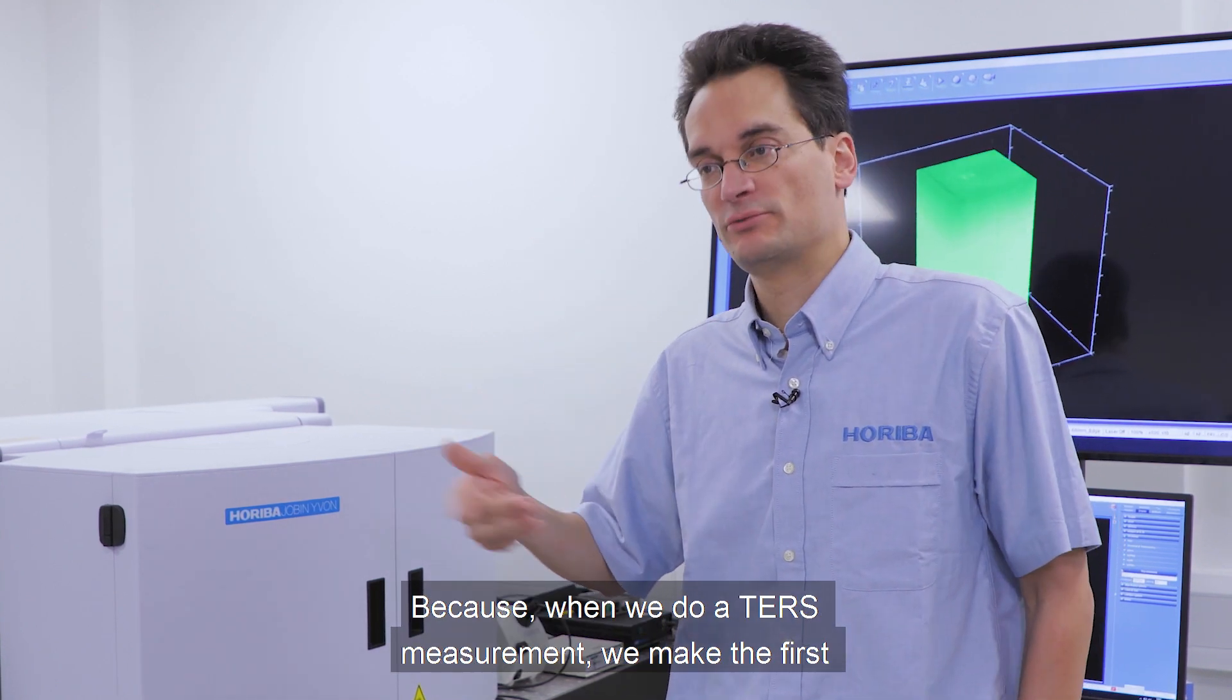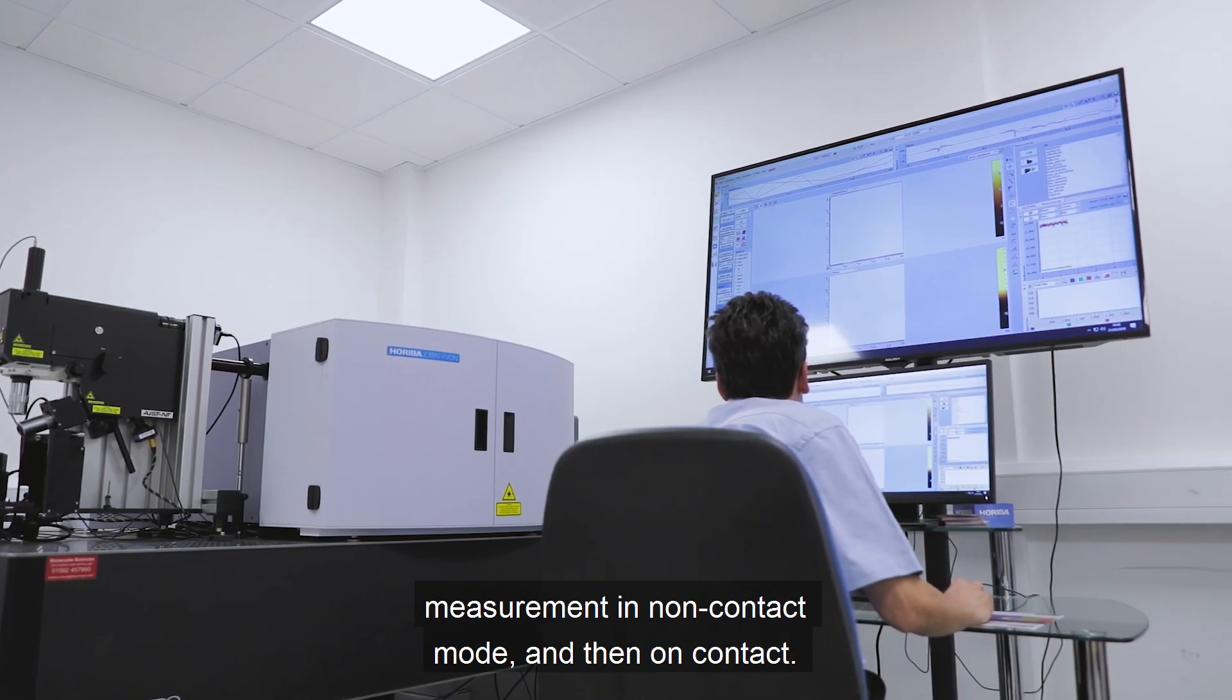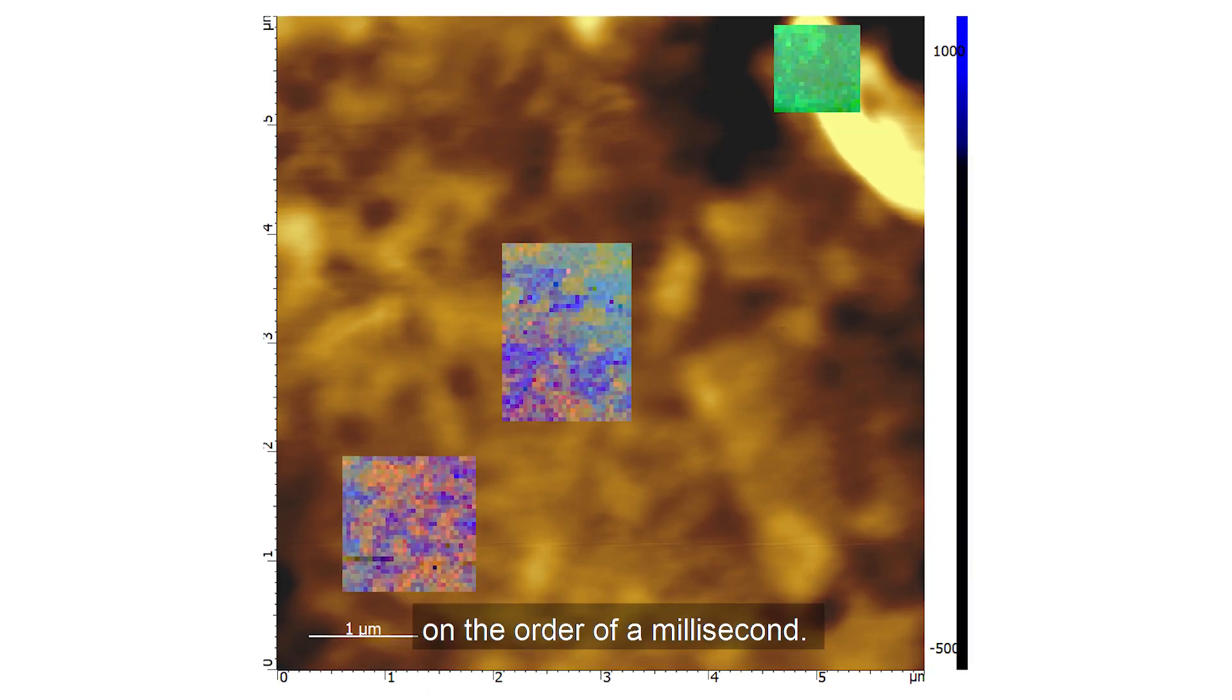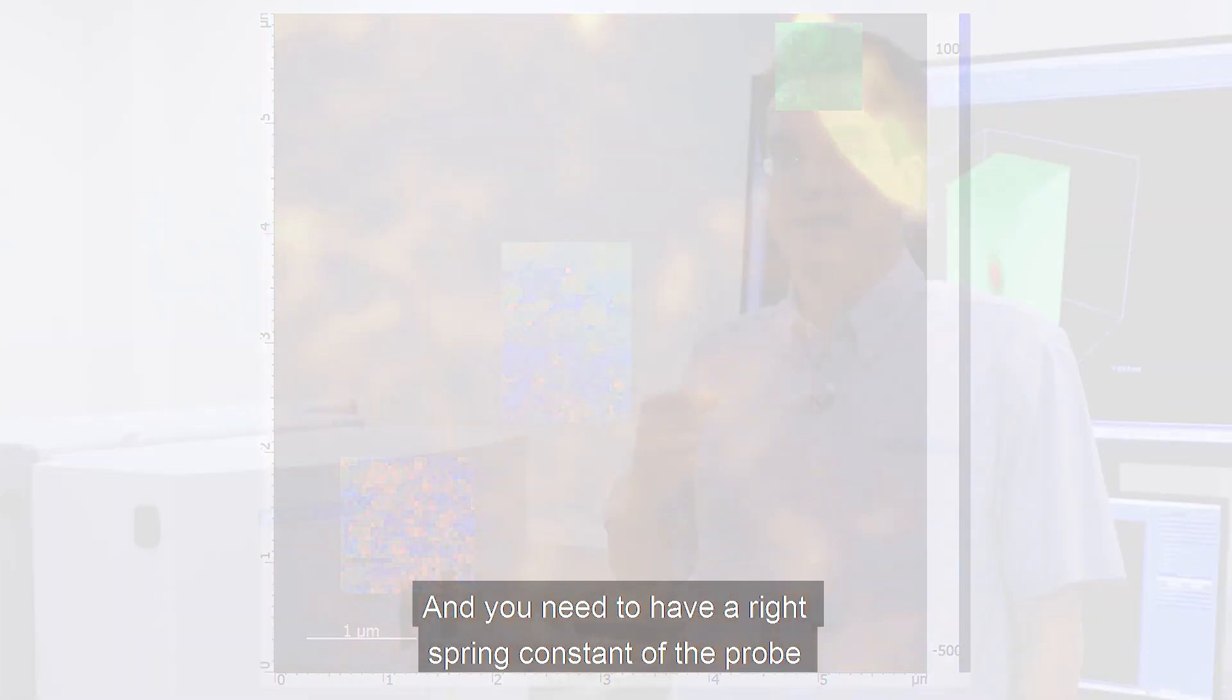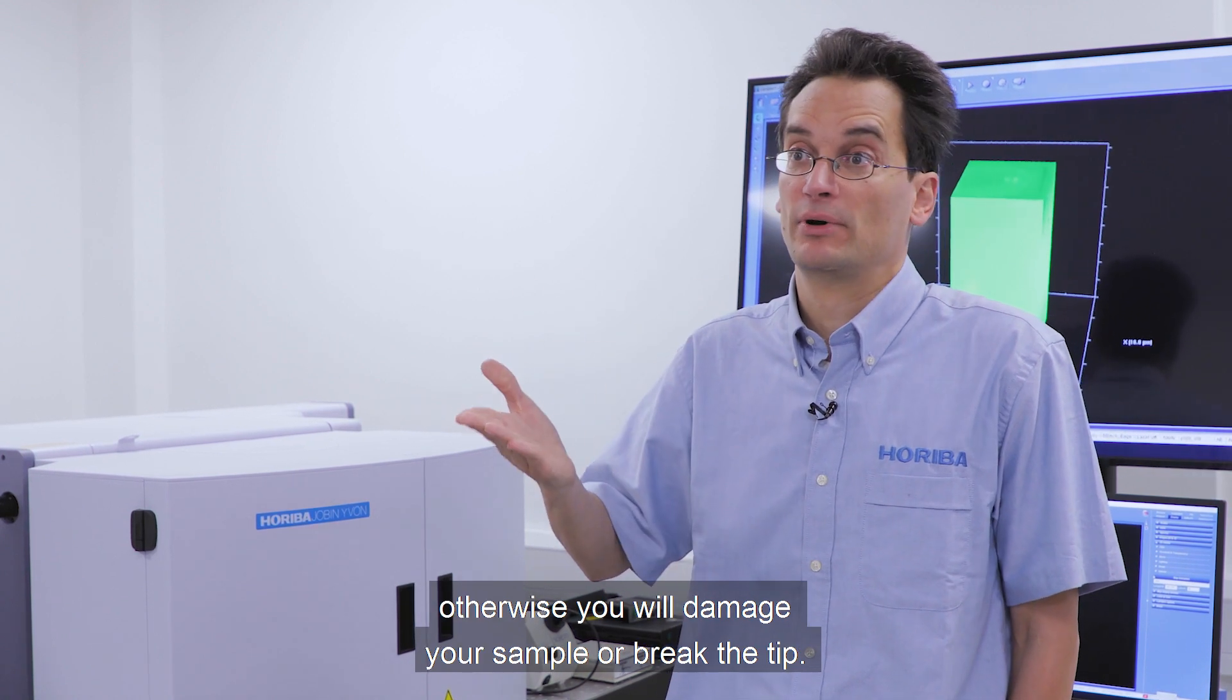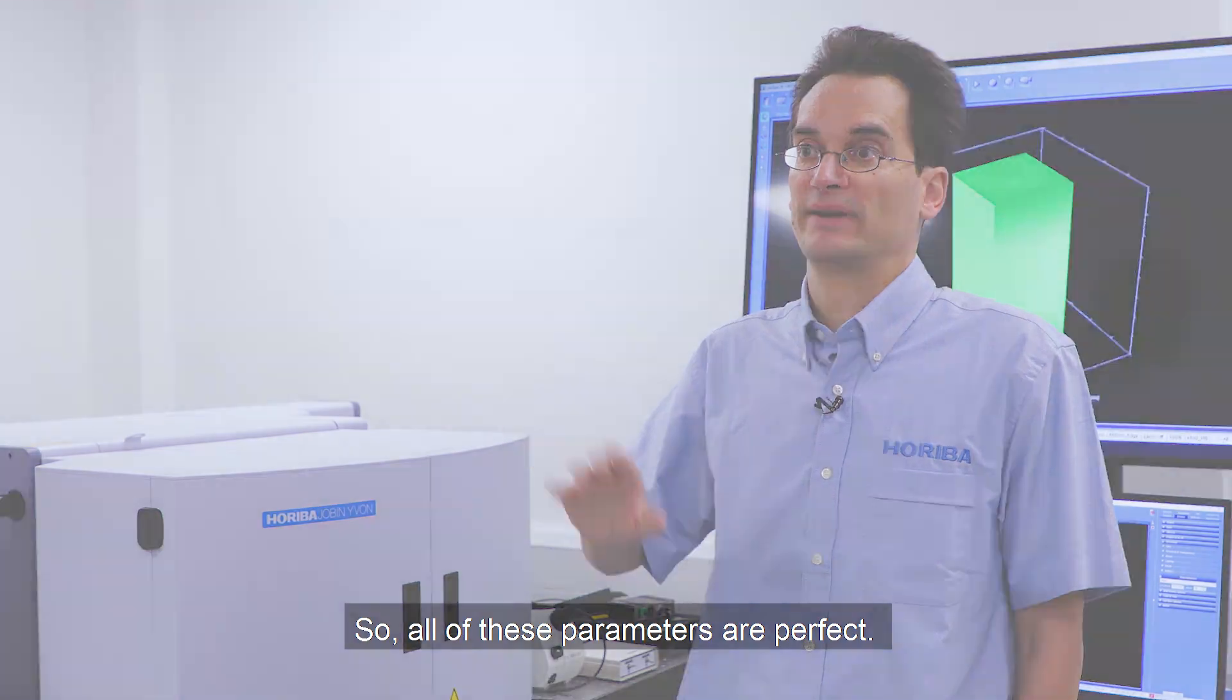in contact and non-contact mode. When we do a TERS measurement, we make a first measurement in non-contact mode and then in contact. You have to swap between the two modes very quickly, on the order of a millisecond. You need to have the right spring constant, otherwise you'll damage your sample or break the tip.